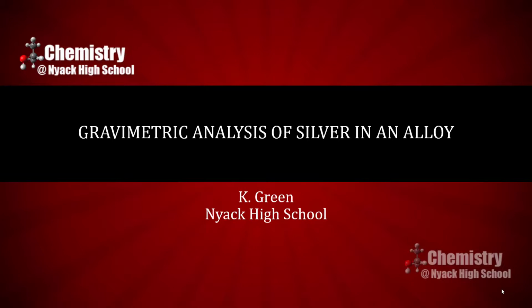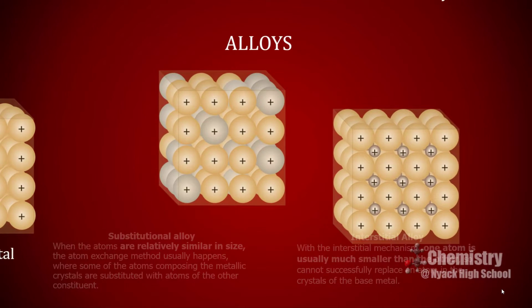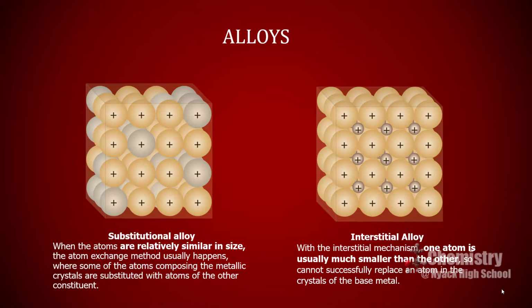Today's lab is a gravimetric analysis of silver in an alloy. Alloys are mixtures of metals or a mixture of a metal and a non-metal. The alloys themselves generally have desirable properties that the pure elements do not have. If the atoms of the elements being mixed with the pure material are relatively close in size to the atoms of the pure element, the alloy formed is the substitutional type of alloy. In this type of alloy, another atom of a different element simply replaces the atom of the native element.